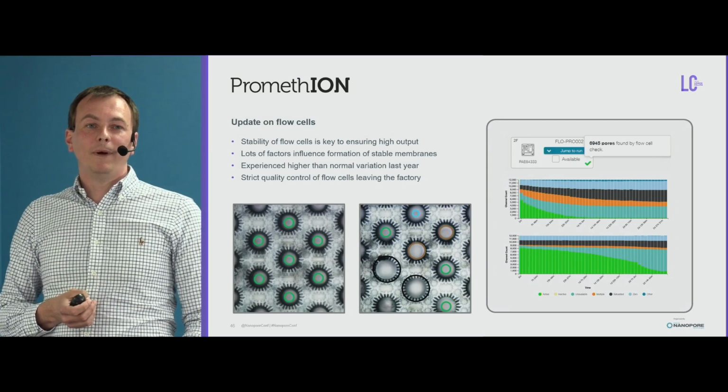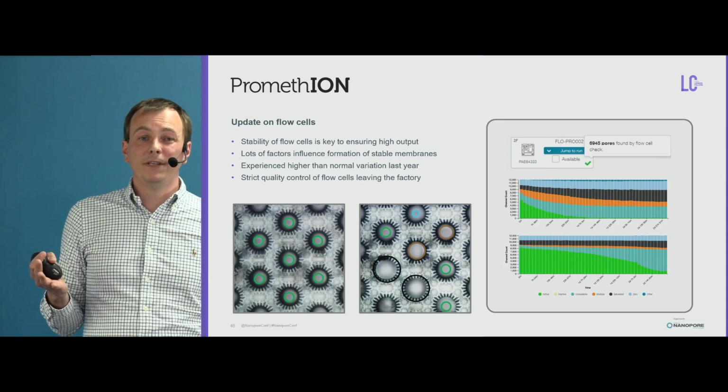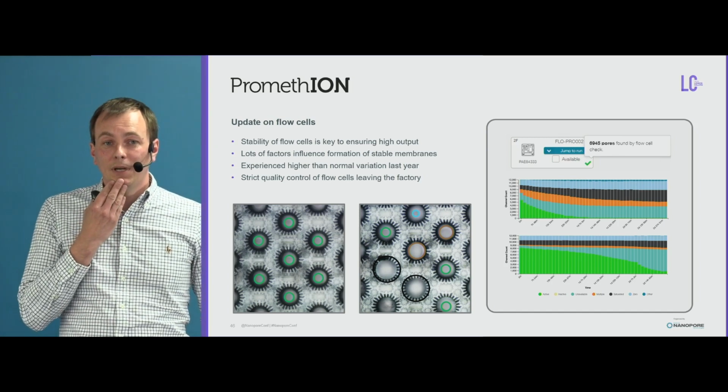So I'm going to spend a few minutes to talk about flow cells. Stability of flow cells is absolutely key for us. We make the flow cells, we form the membranes here in Oxford. We QC everything that goes out the door.